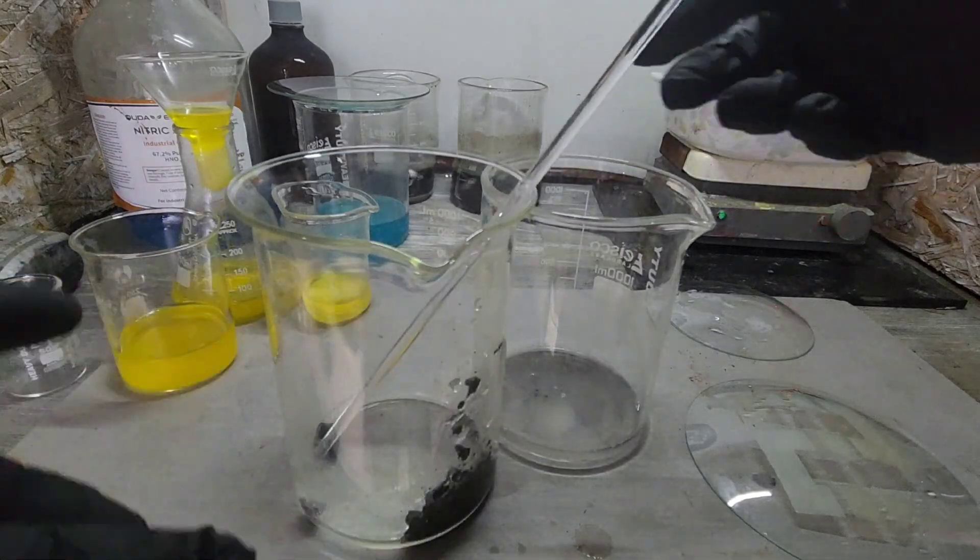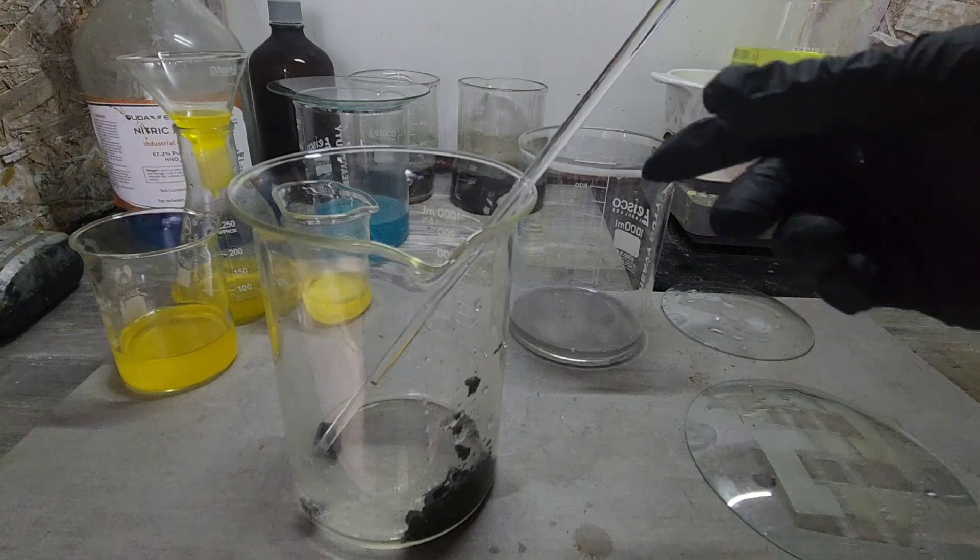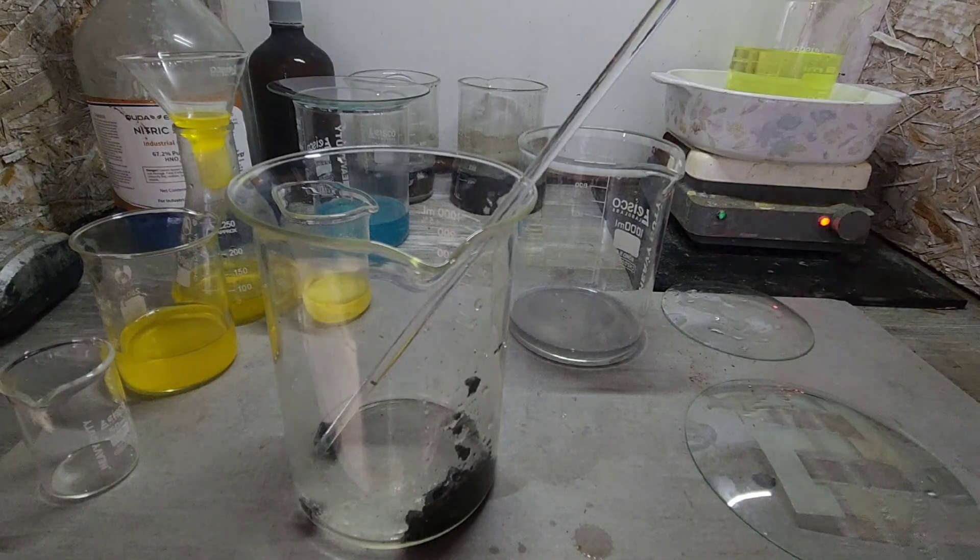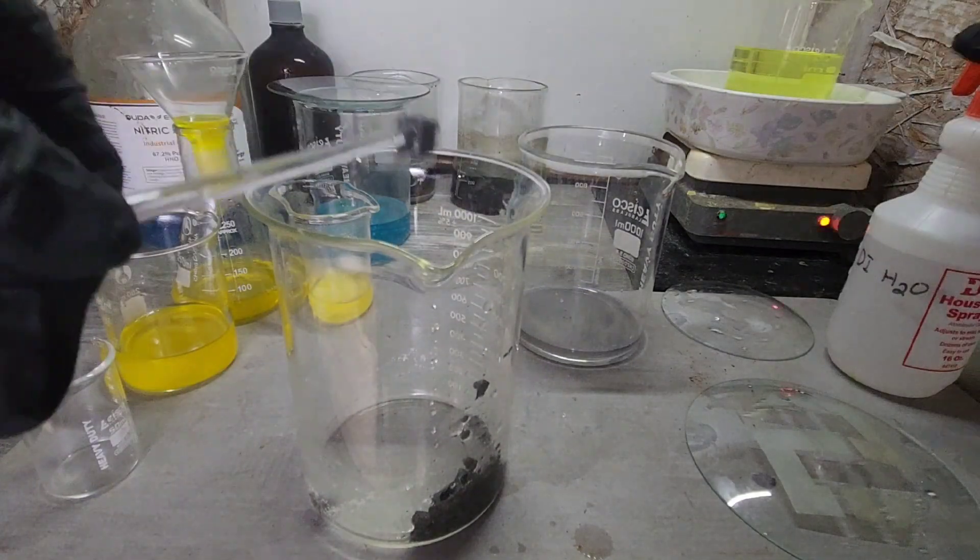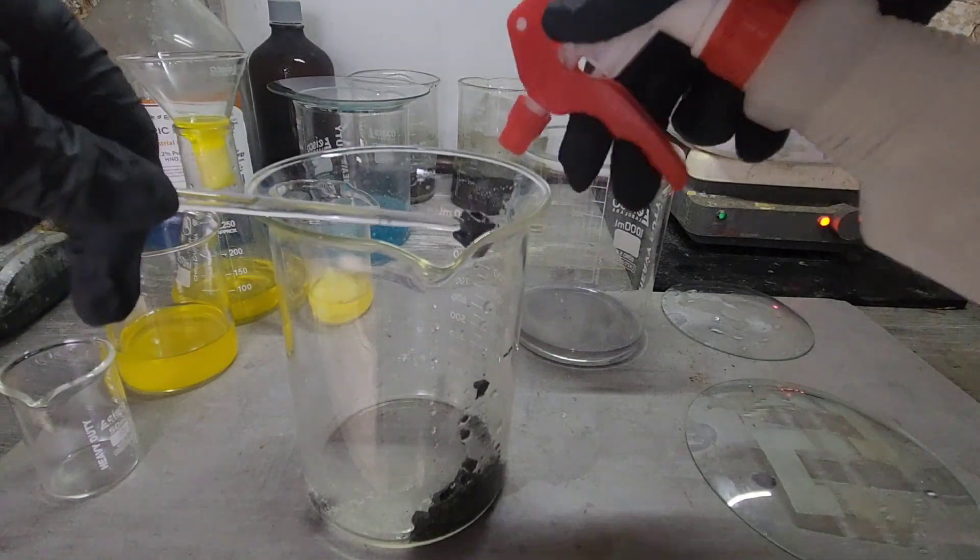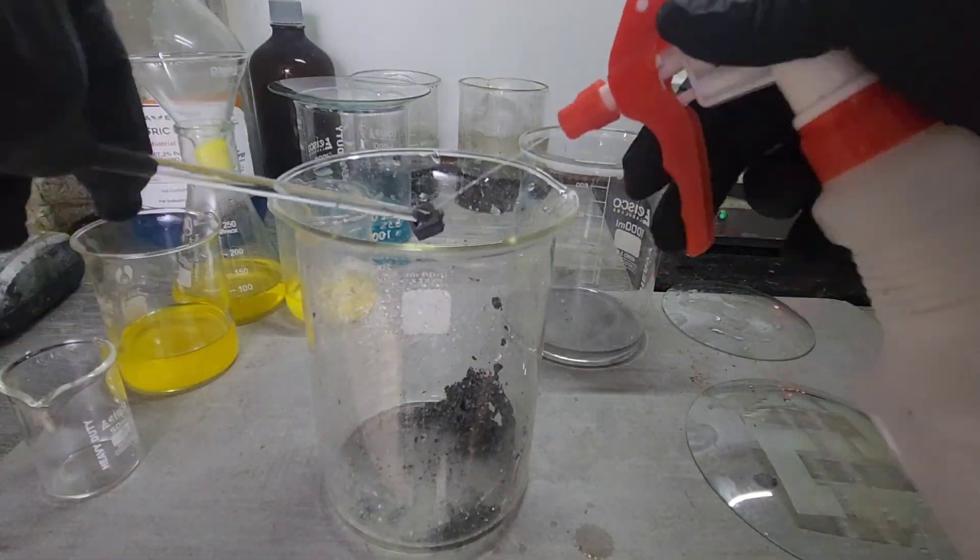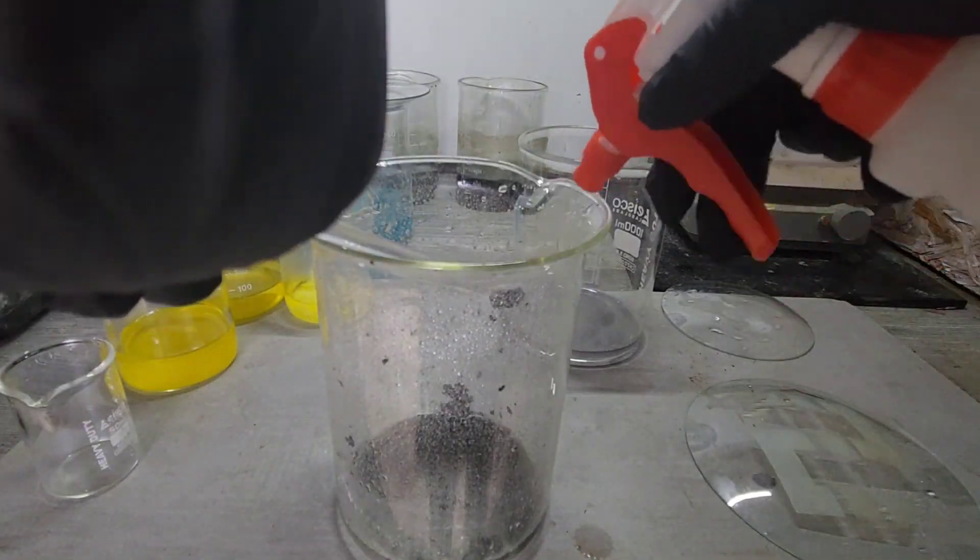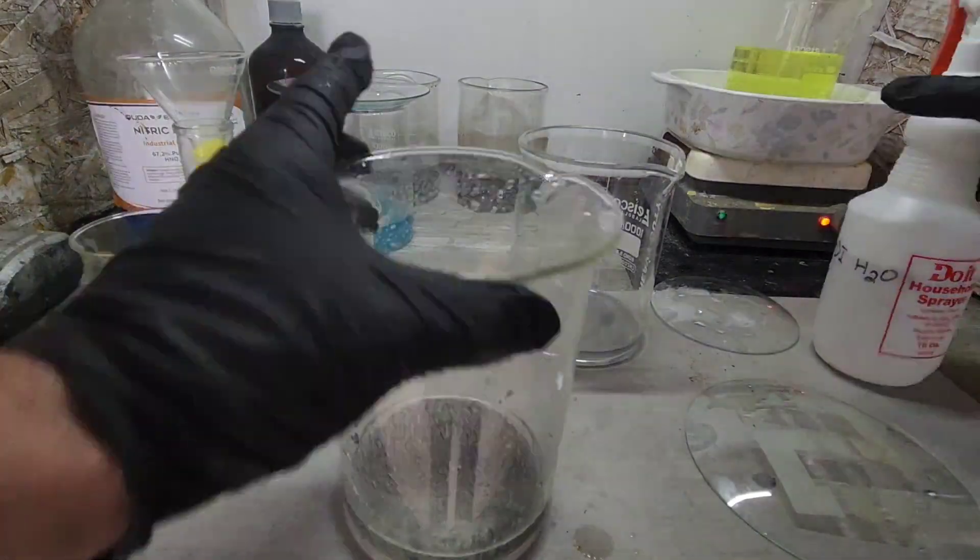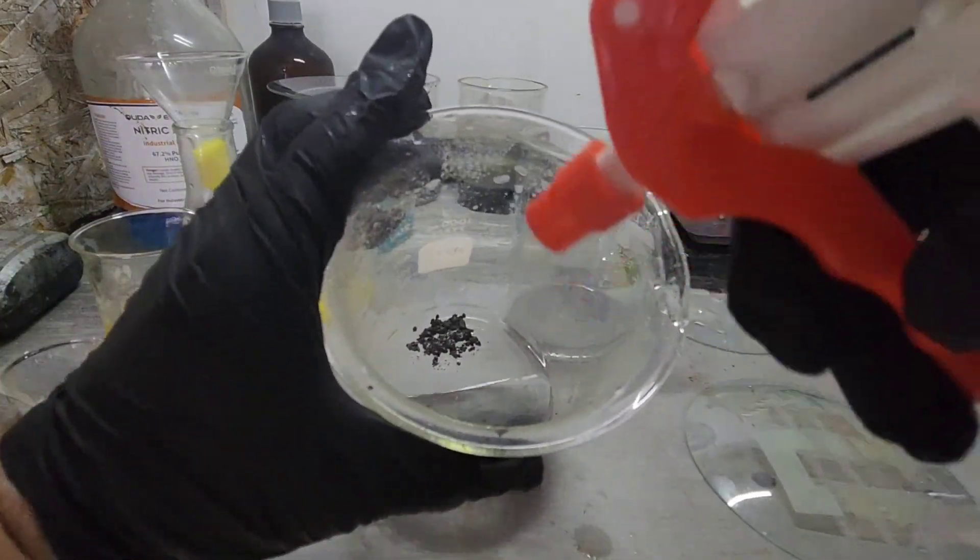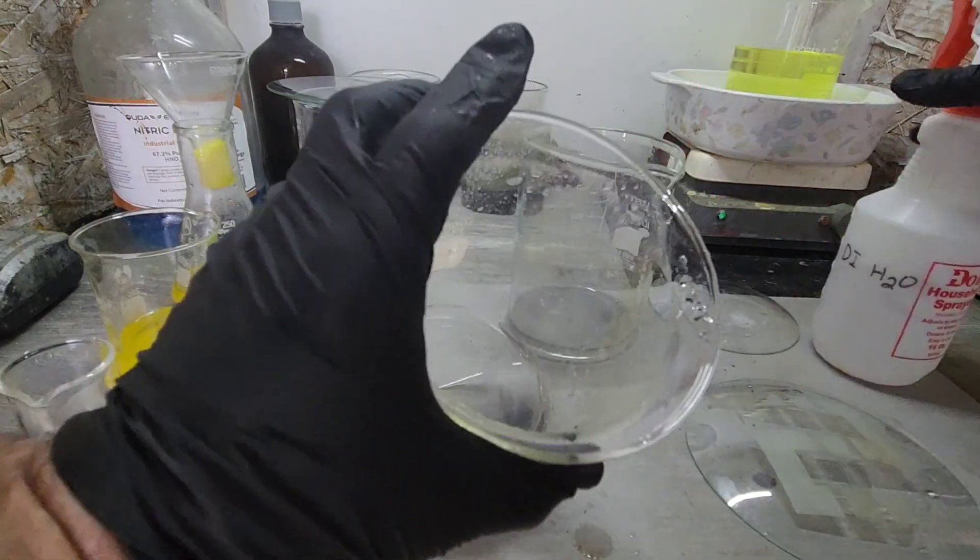So I want to get these three little aluminum pieces out which do contain silver. And we have a decent amount of cement silver in there.